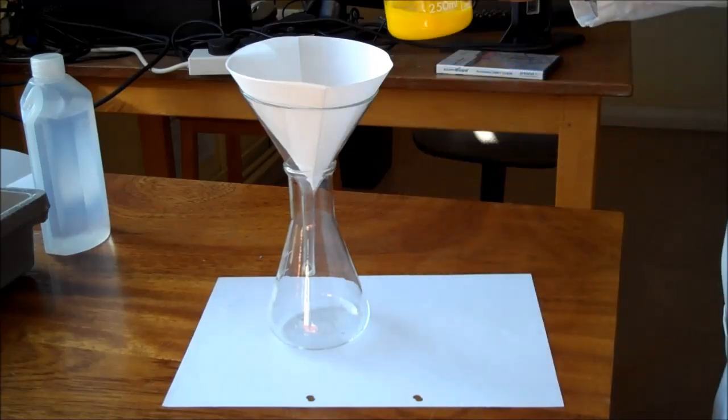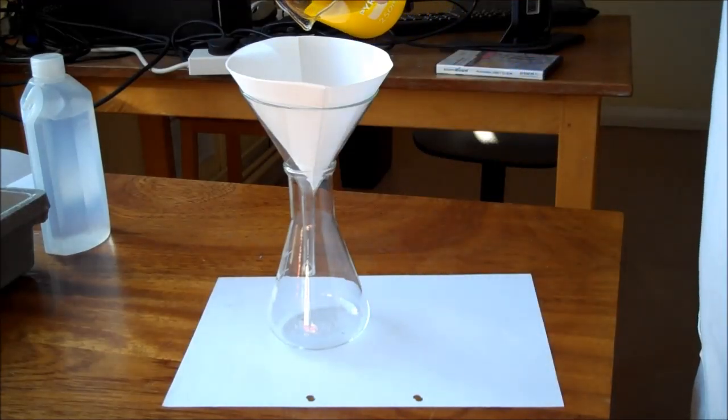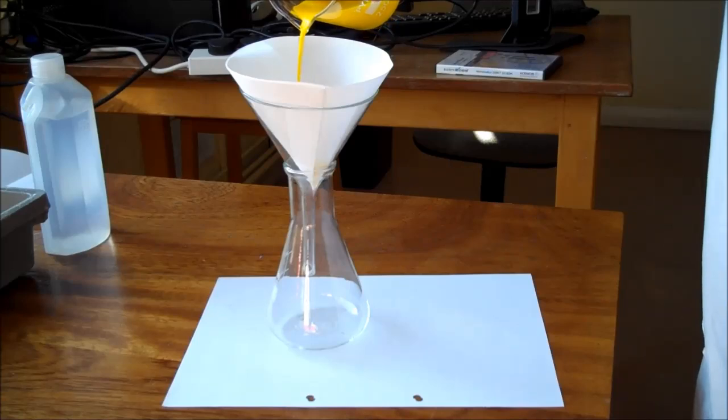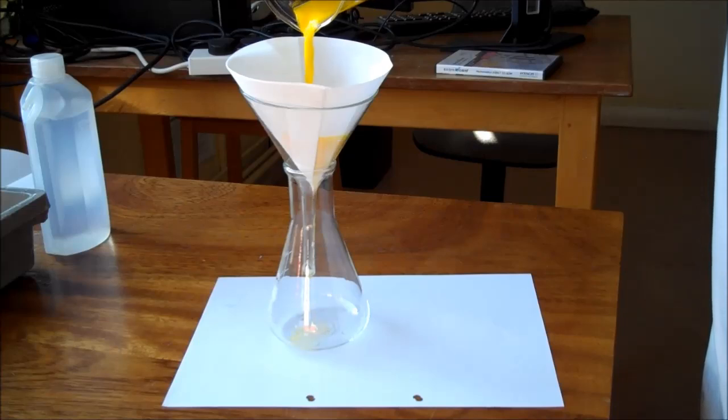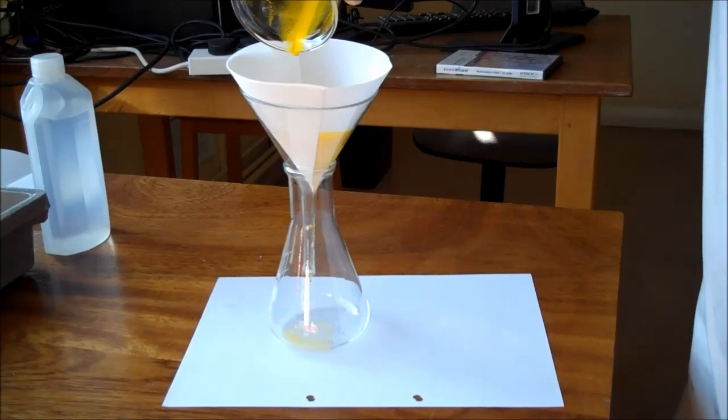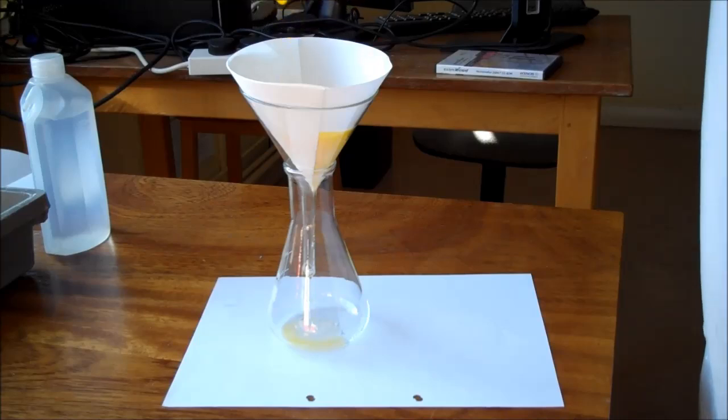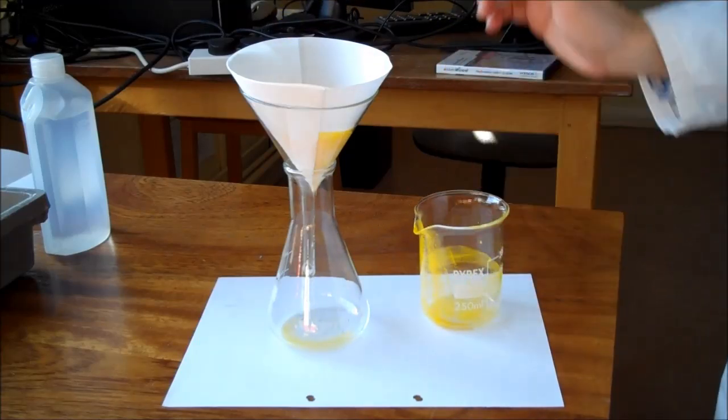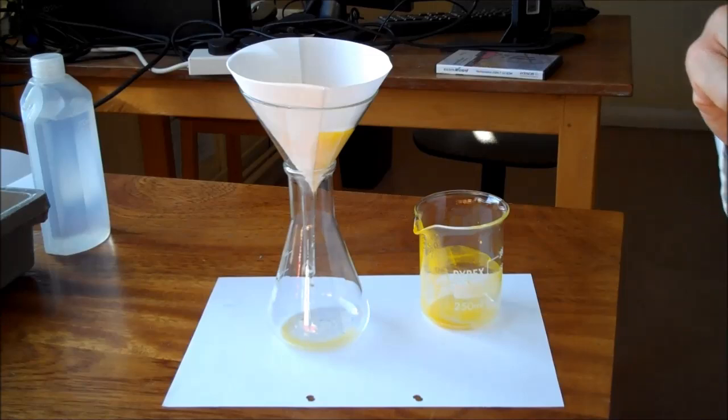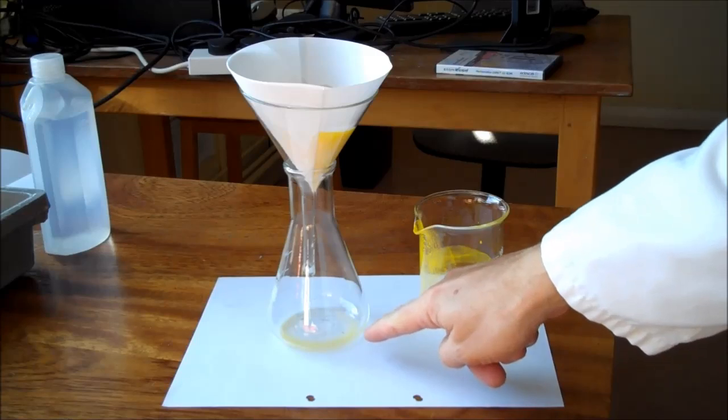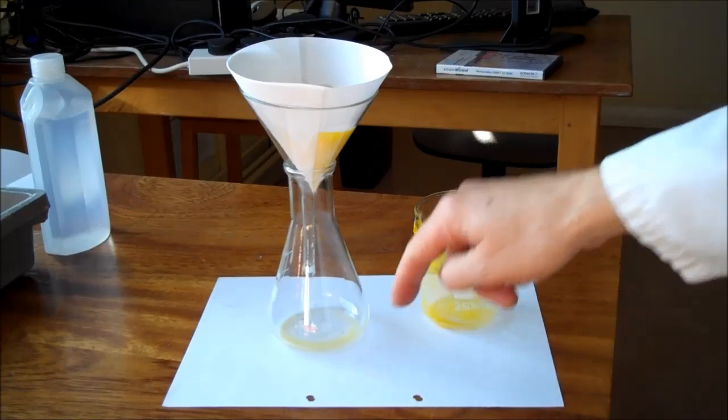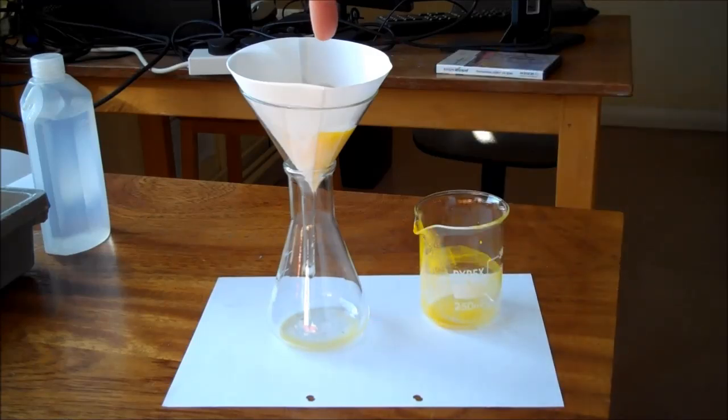We're going to filter off our yellow insoluble solid. Being insoluble, it shouldn't come through the filter paper. You will find that a trace of it does in this case because the particles are so fine, but most of it will stay in the filter funnel. What we're going to end up with is mainly a solution of soluble products and our insoluble precipitate of lead iodide in the filter funnel.